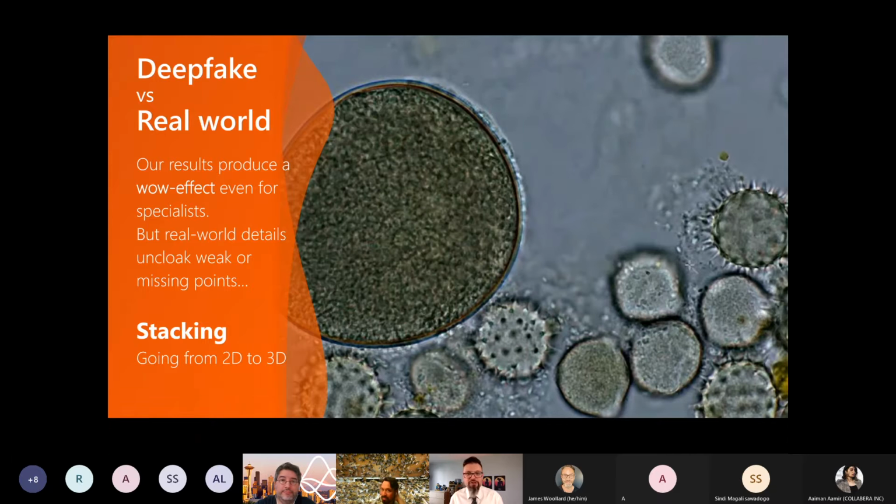For example, we discussed with a university, and they said, "Oh, it's impossible to have that pollen and that pollen in the same image," because the first one is in France and the other one is in Africa. So there are some flaws in our image generation. But it was the first step to start the discussion and to go one step further and enhance the algorithm.